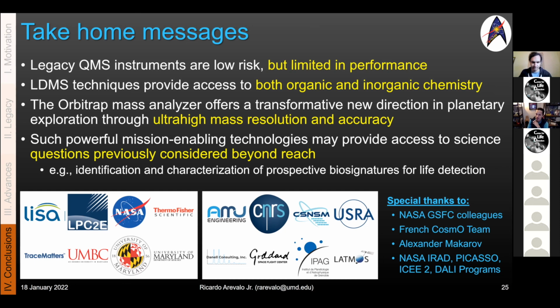Internal, you can always make your numbers look pretty good, but we wanted to understand the external reproducibility because every laser shot gives us an independent mass spectrum. And we were able to meet the 10 per mil metric that the STT wanted from a 2 sigma perspective. That being said, if we're fractionating to some degree smaller than 10 per mil, we wouldn't see it. So within our external reproducibility, we saw terrestrial values, which is what we would expect.